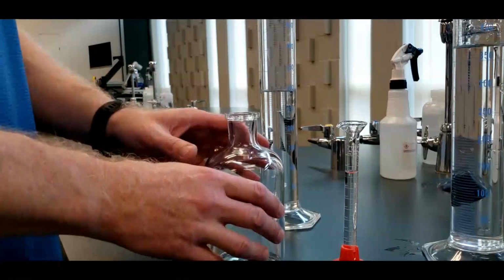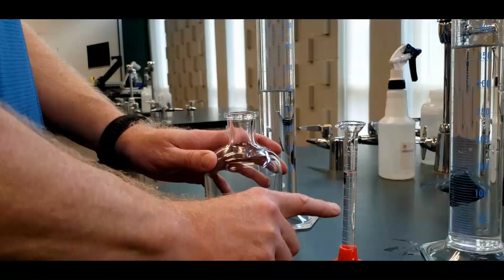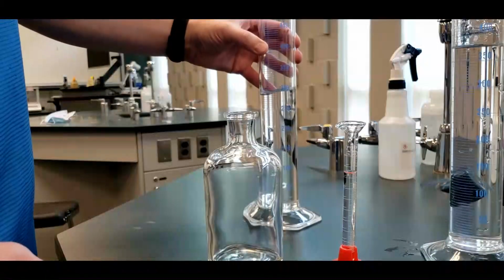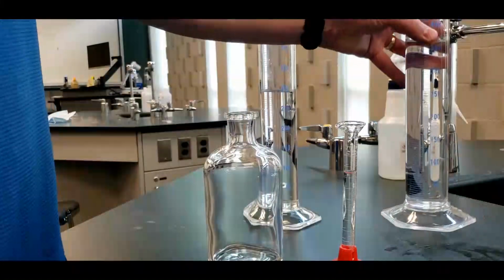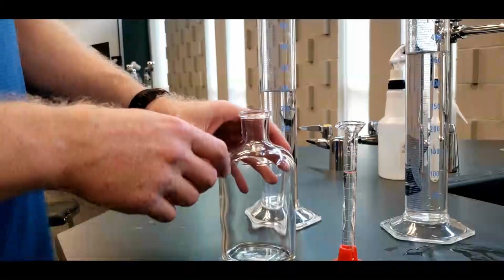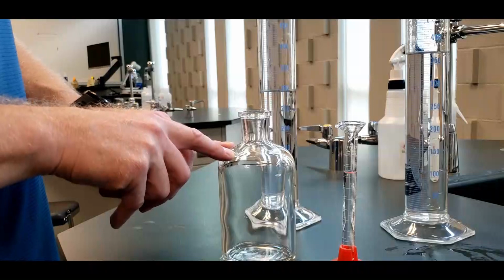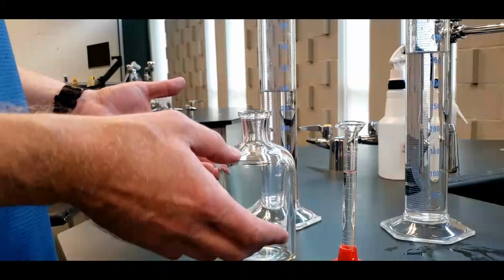All right, so we have our 500 ml bottle, we have our 8.3 mils of sodium hydroxide, and then 300 mils of distilled water here, and then some more over here to finish up, because we're going to be adding in the water and the sodium hydroxide until we're to about the shoulder. And that doesn't seem very precise, and it's not. It doesn't have to be.